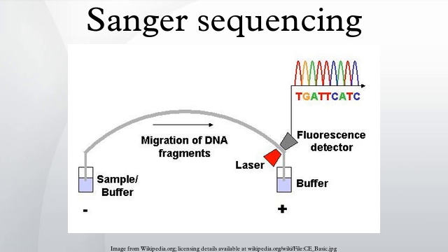Device design. The sequencing chip has a four-layer construction, consisting of three 100 mm diameter glass wafers and a polydimethylsiloxane membrane. Reaction chambers and capillary electrophoresis channels are etched between the top two glass wafers, which are thermally bonded. Three-dimensional channel interconnections and microvalves are formed by the PDMS and bottom manifold glass wafer.